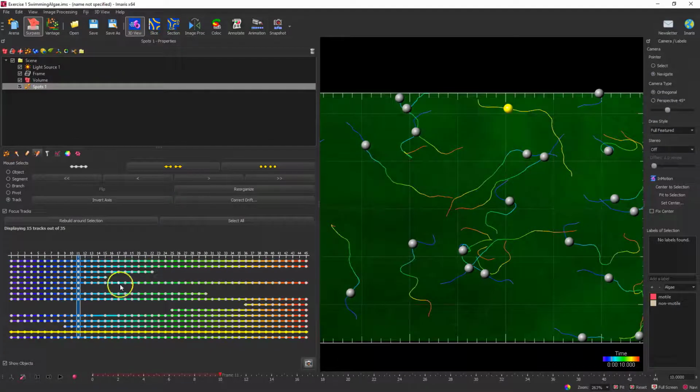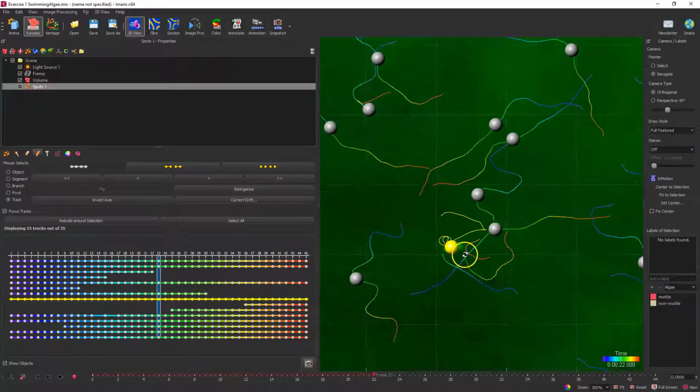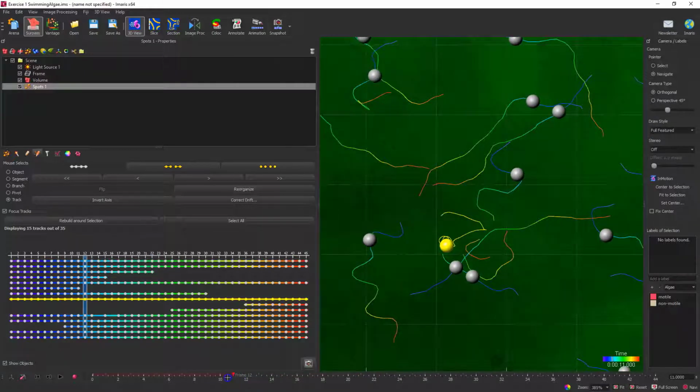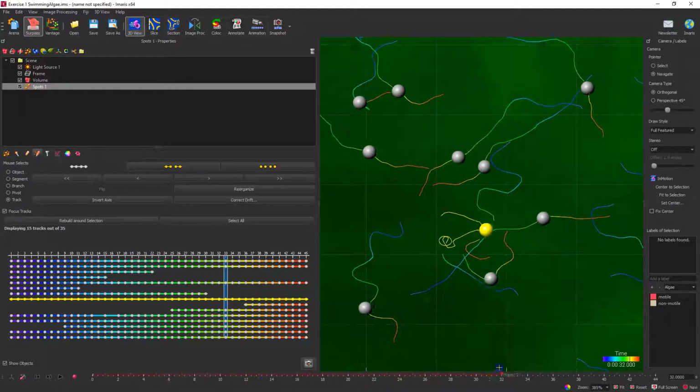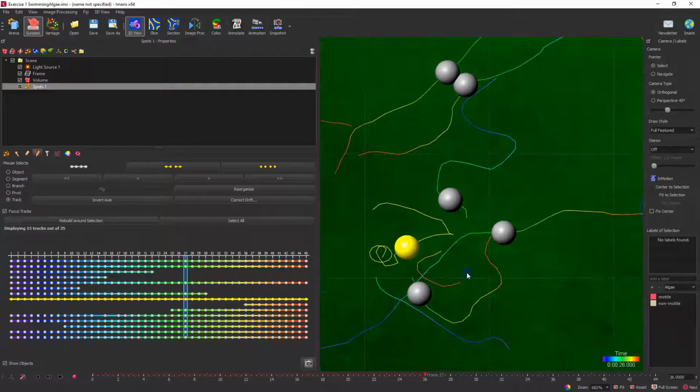So let's just go through here, and I just want to make sure that we tracked this data set correctly. All right. So I'm going through here and I do see some breaks. I see some of what I call drama going on. So here we can see that there's some things that might not be tracked correctly. I got some broken tracks, some things going backwards and forwards, some little segments here. So let's see if we can make heads or tails of this, and let's see if we can figure it out.